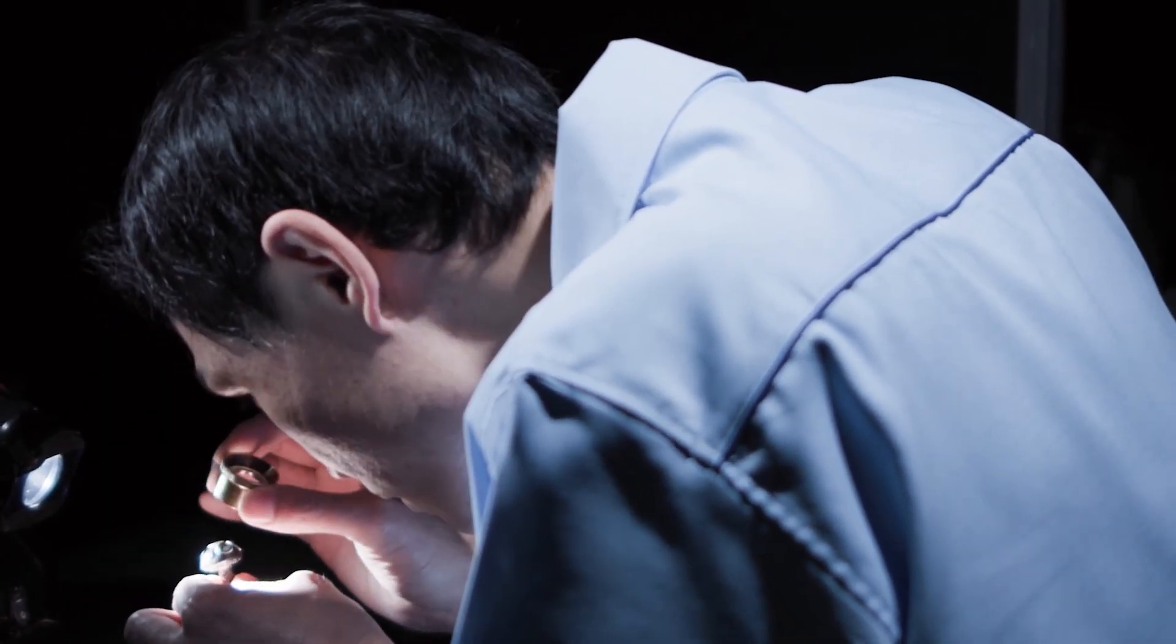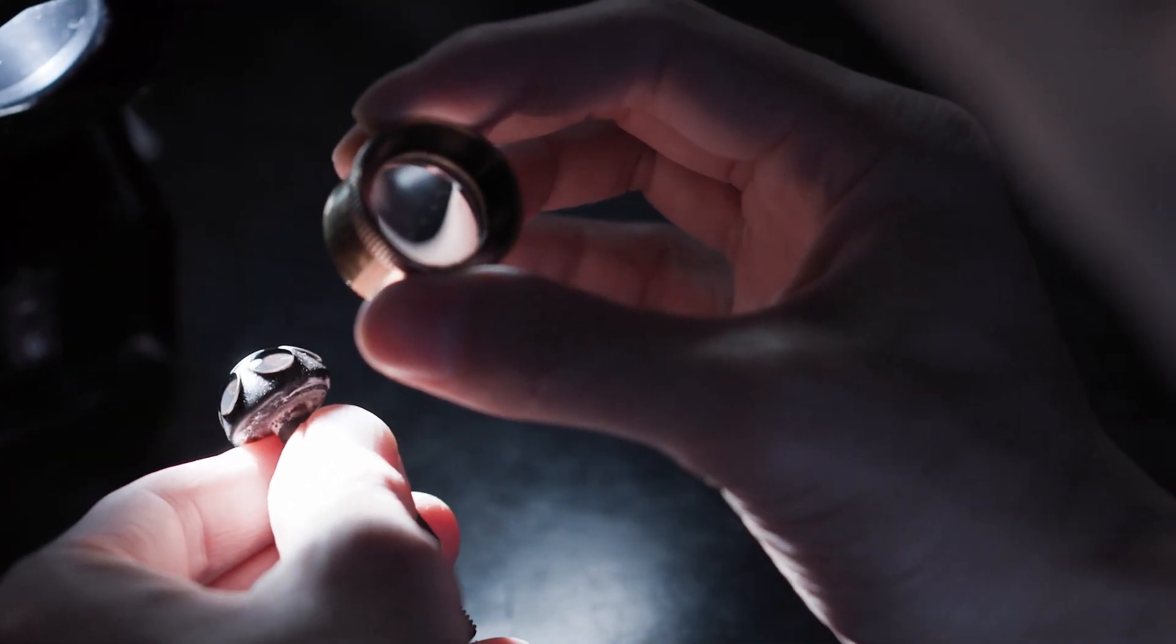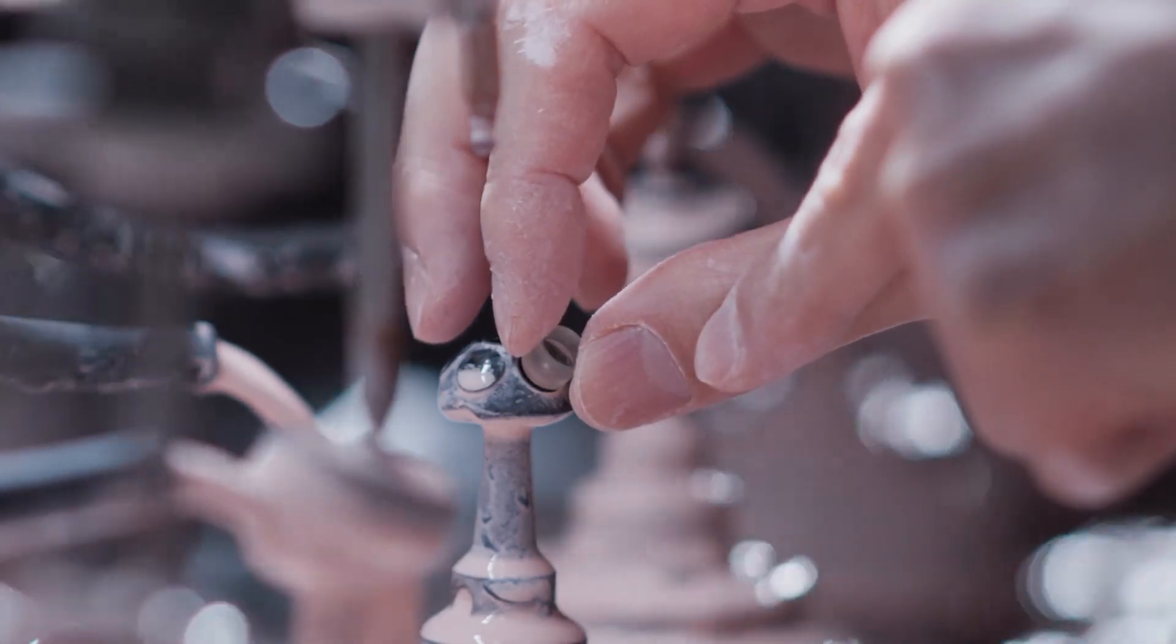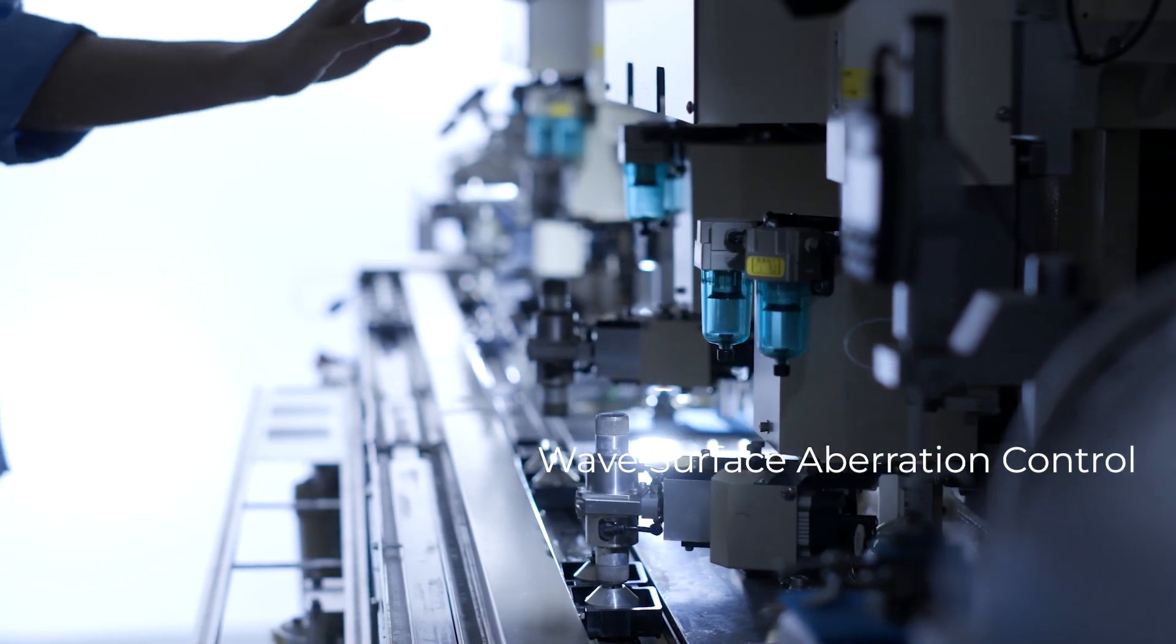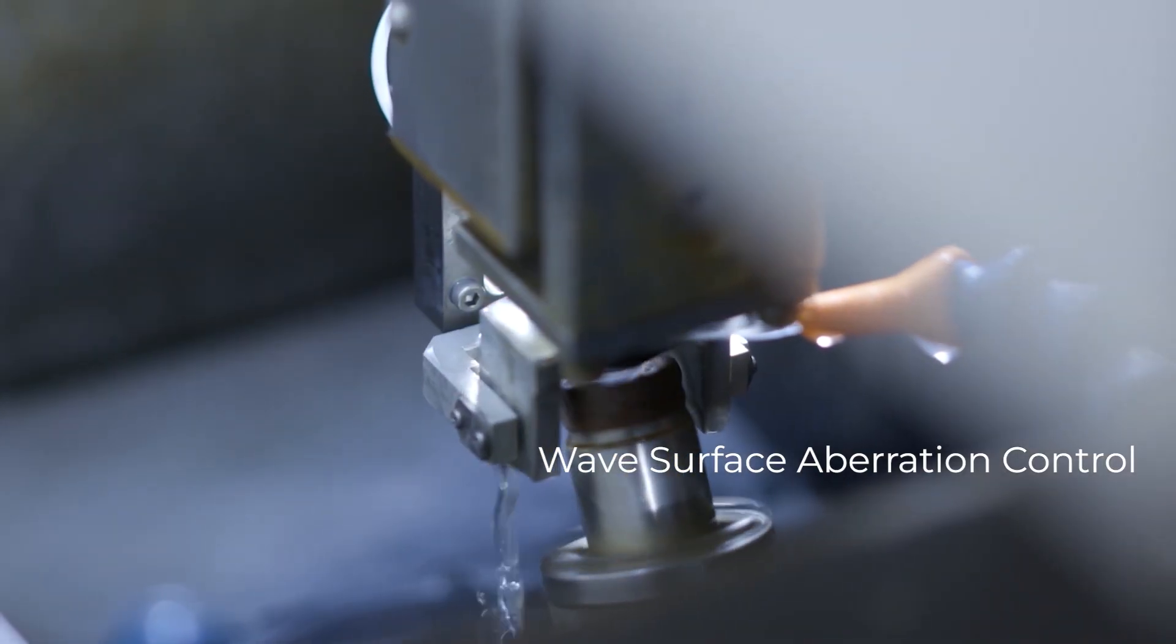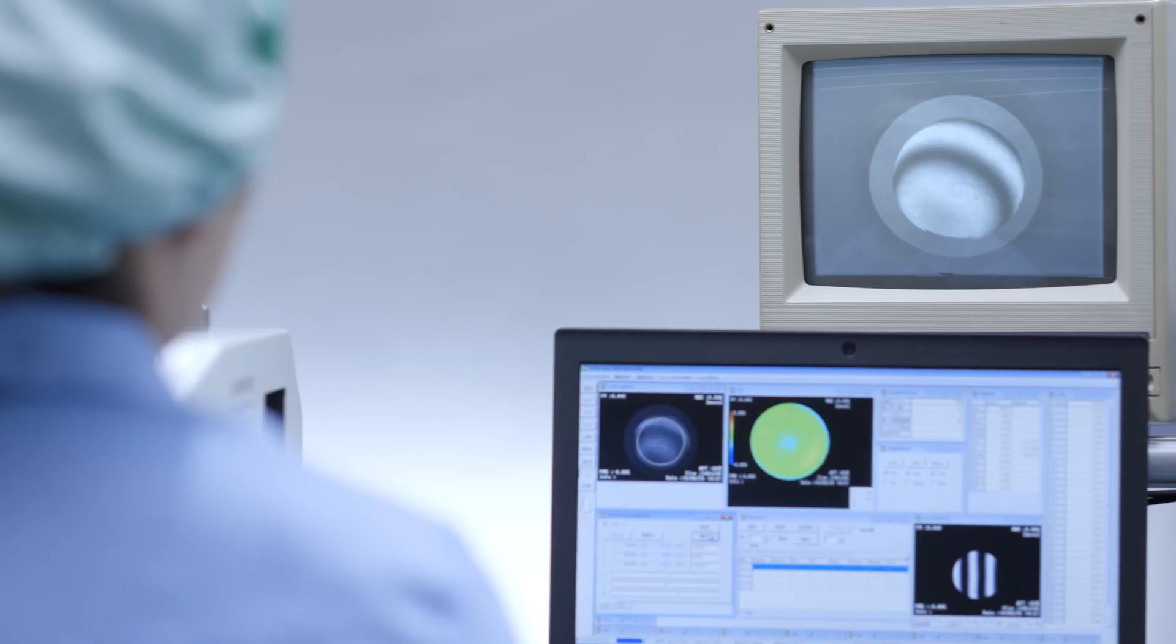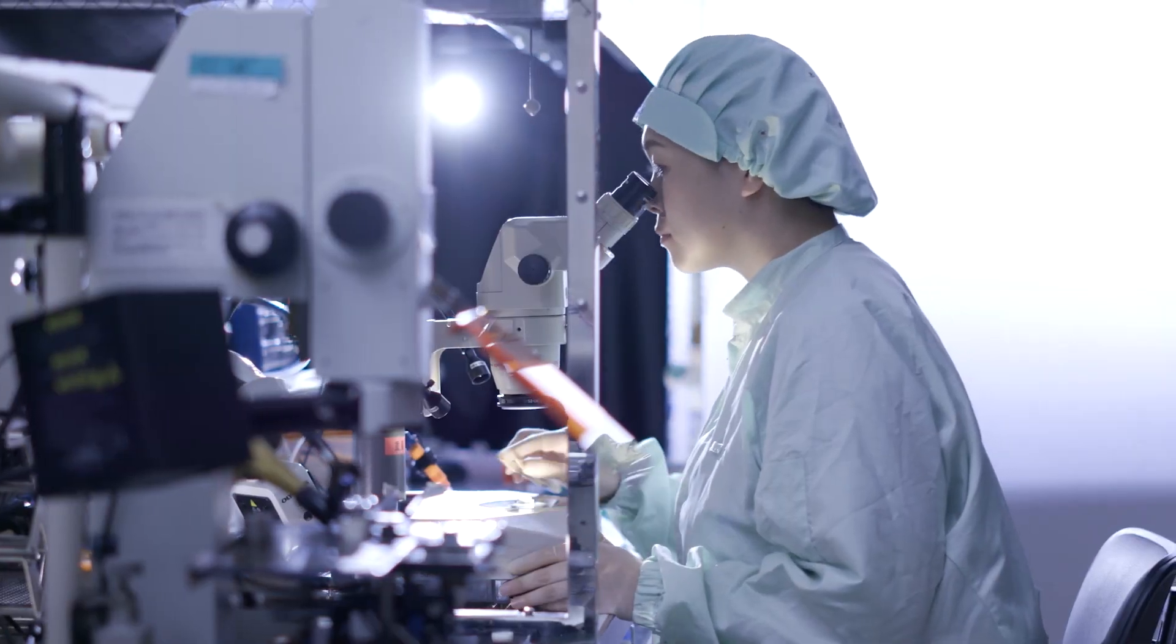But these specialists are unable to efficiently produce optics on a large scale because of the time they invest in polishing lenses to the desired specification without damaging them in the process. A new quality standard, referred to as wave surface aberration control, enables high-quality mass production of optics by simultaneously automating traditionally manual processes such as assembly and optical error measurement.